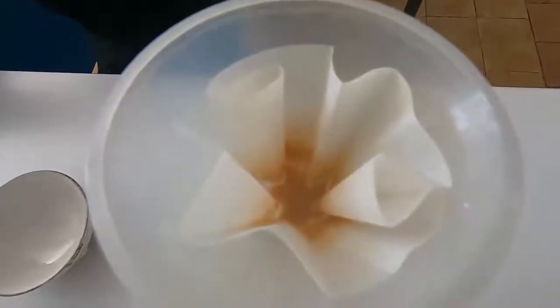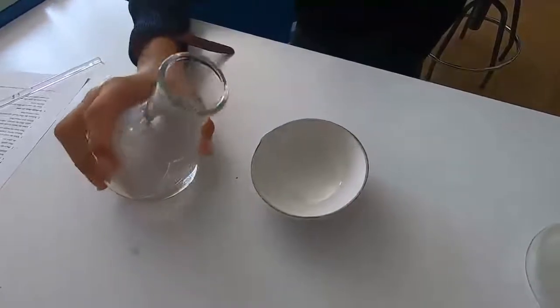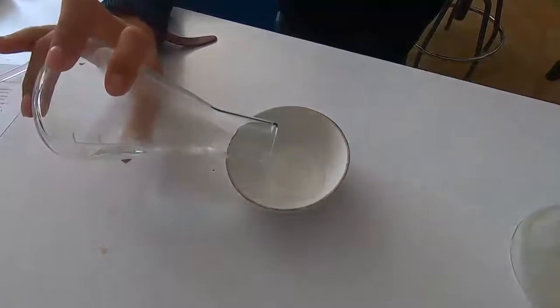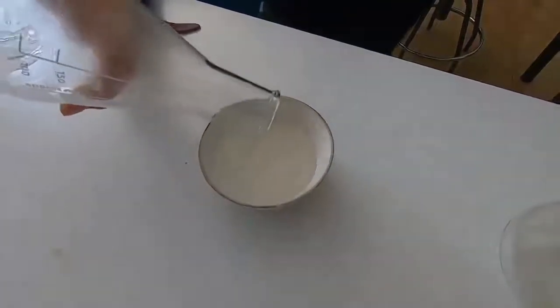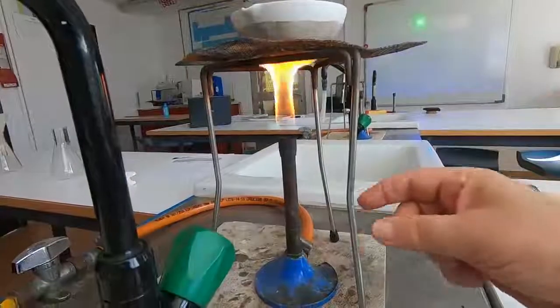There's the clear liquid that we've obtained — that's called the filtrate — and that's the residue. The residue we're not interested in for this particular experiment. So we're going to pour the filtrate into an evaporating basin so it goes nice and clear, and then we're going to heat that on the Bunsen burner with a blue flame.